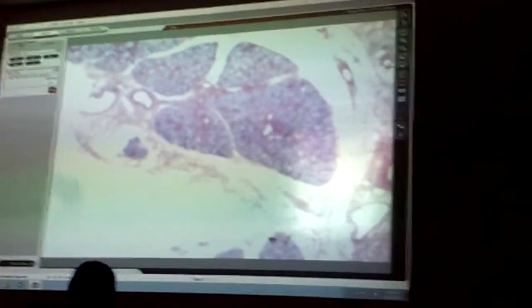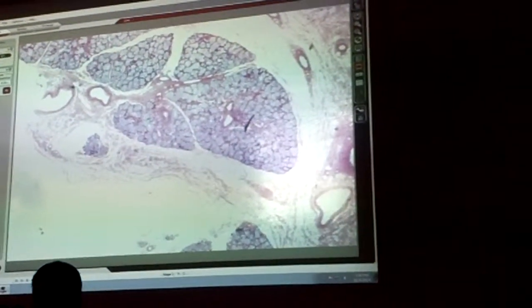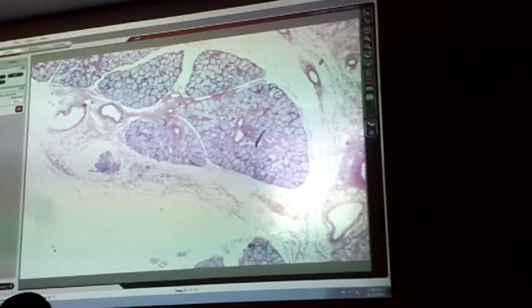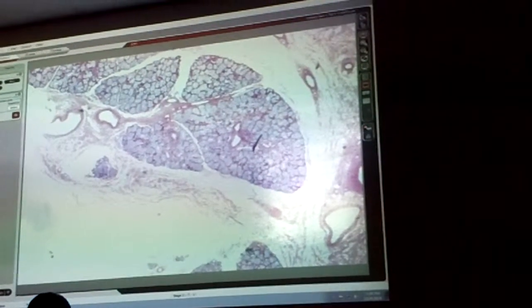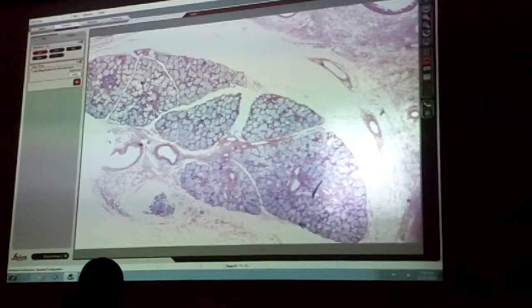All right, with sublingual, we have mucus acini, the salivary ducts, but then we have what's called serous demilunes. Now there are serous acini in here, it's just that they're harder to see because the mucus acini is now the more prolific cell type. So the serous demilune is going to be something of a unique structure to this.